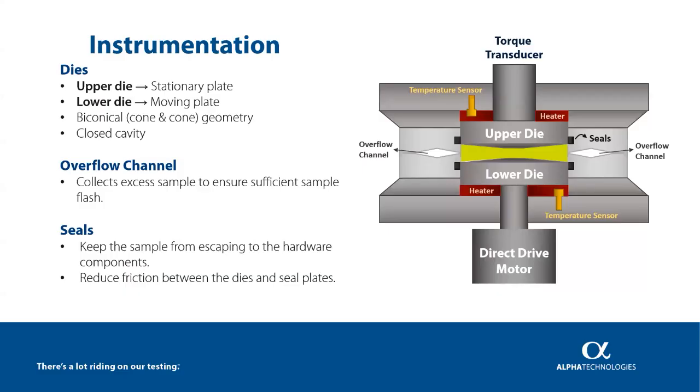Finally, we have seals, which prevent the material from leaking into the hardware components and help reduce friction between the dies and the seal plates.